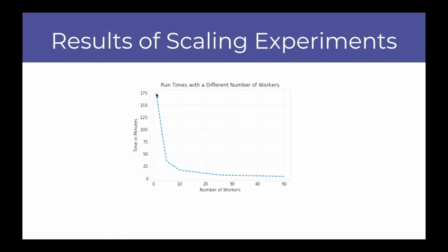So our parallel experiments are achieving what we wanted. We are saving time, and we are exploiting the resources that we have. And again, the beauty of Phenomenal is that it allows us to do that programmatically, and it's so flexible that we can run really anything we wish.